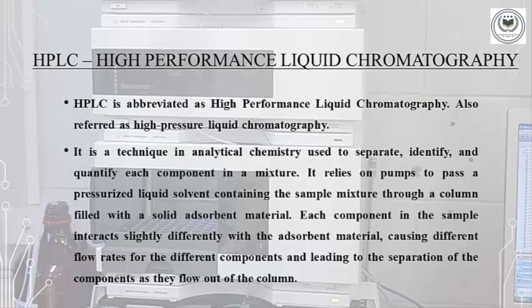It relies on a pump to pass a pressurized liquid solvent containing the sample mixture through a column filled with a solid adsorbent material. Each component in the sample interacts slightly differently with the adsorbent material, causing different flow rates for the different components and leading to the separation of the components as they flow out of the column.